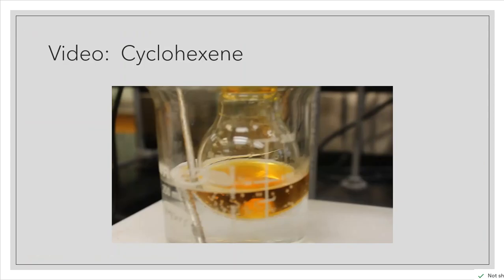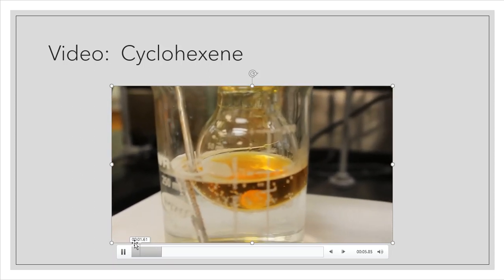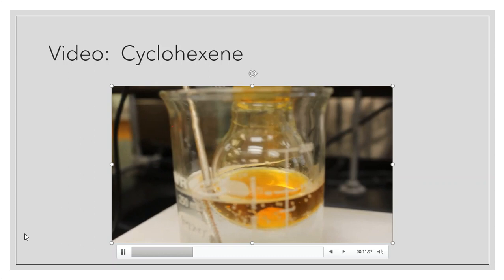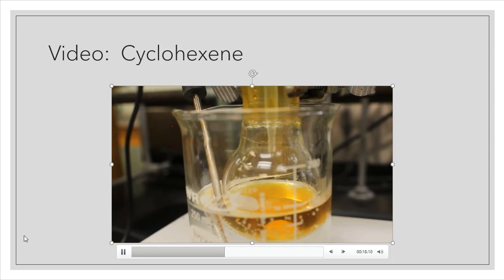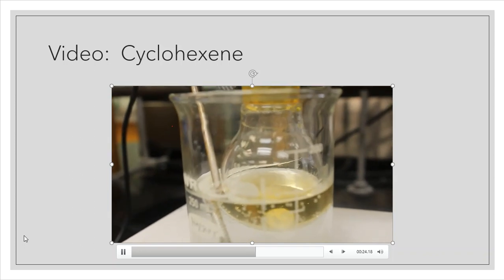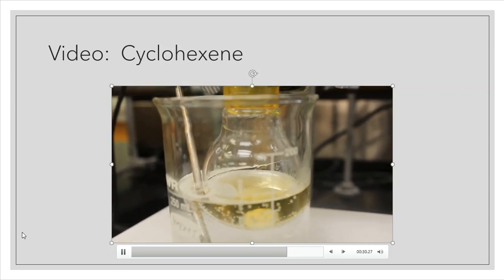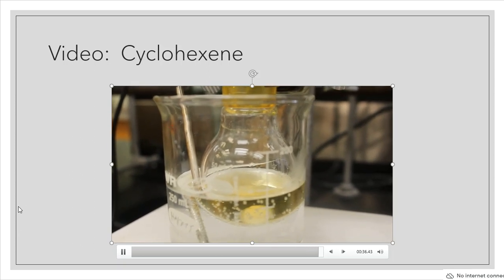All right, so here's a video of the addition of the cyclohexene. Okay, so we're getting ready to add it to this solution. The reason is that I still see a little bit of orange color associated with the flask. I'm just going to add one or two drops into the flask. You're going to see what happens here, if anything, and you can make your observations the way that you need to. Keep in mind, it has a double bond, and that double bond is getting destroyed by any extra residual bromine that might be left behind.